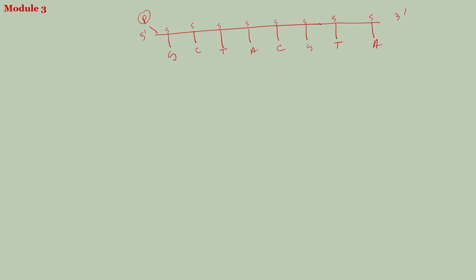So, let us take that this is your target DNA, the sugar, the base, sugar base.